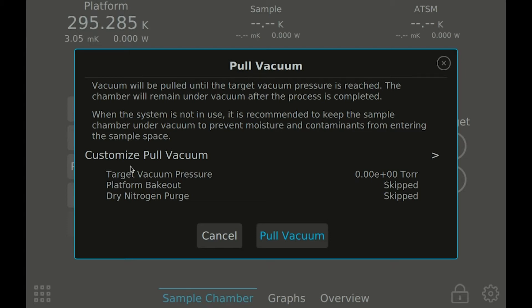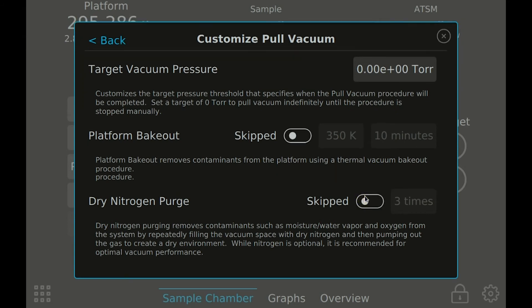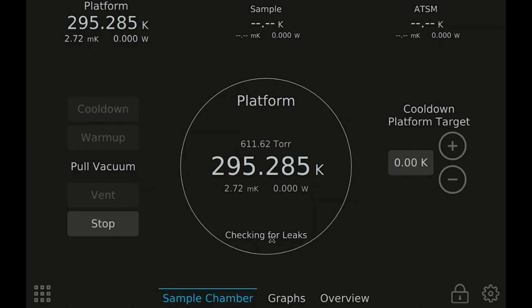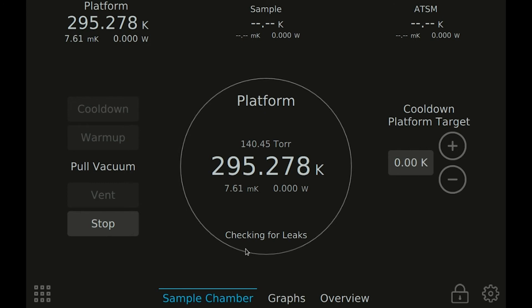These confirmation dialogs will also provide contextual information and present any options available that affect that change. The main operate view shows the primary information that is relevant during normal operation of the system — things like sample chamber pressure, the platform temperature, and platform temperature stability are displayed in the center of the screen along with messages to indicate what the system is currently doing.